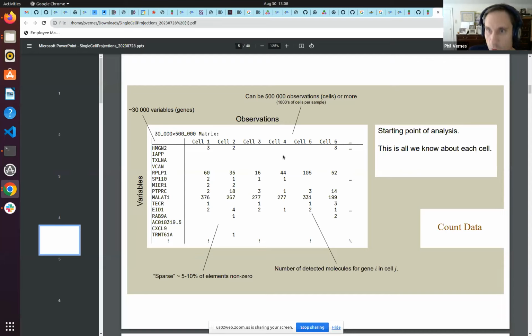So this will also impact the design of the program, because considering that most of this matrix, and this is a matrix of counts, is empty, we obviously need to use a sparse matrix data type, which is what we end up doing. So when we evaluate the count data portion of this matrix, you're going to see that it's actually a sparse matrix, which means it's going to be represented and computed very differently than what we would usually see as a dense matrix.